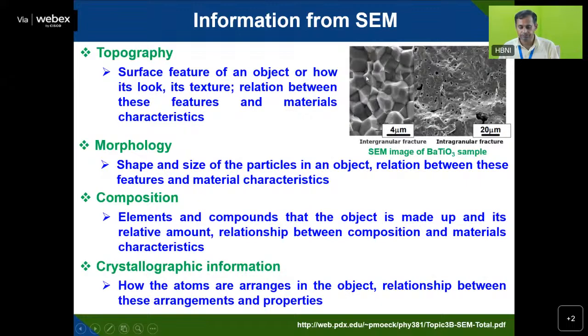You can see what the surface features look like. You have the grain size, and the granular structure that you are able to see in this image.